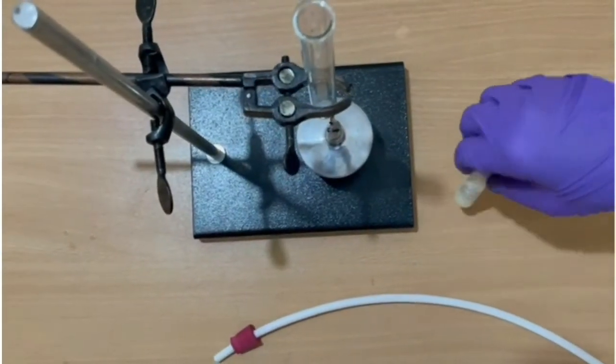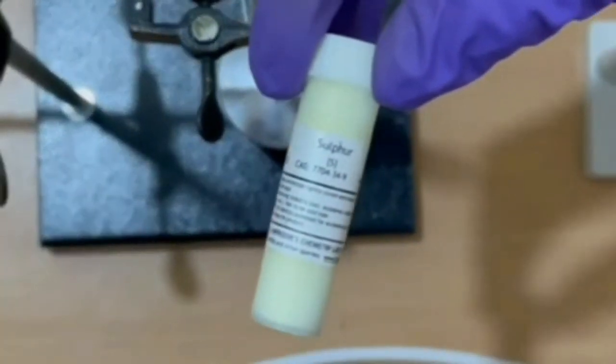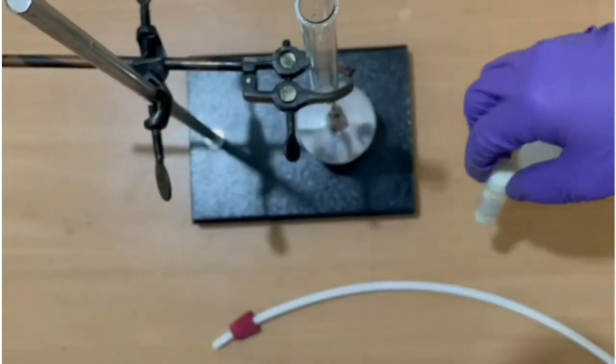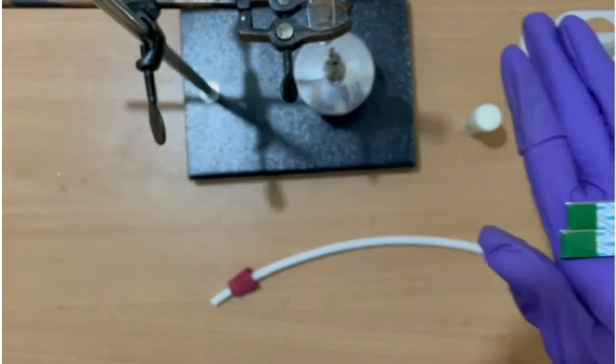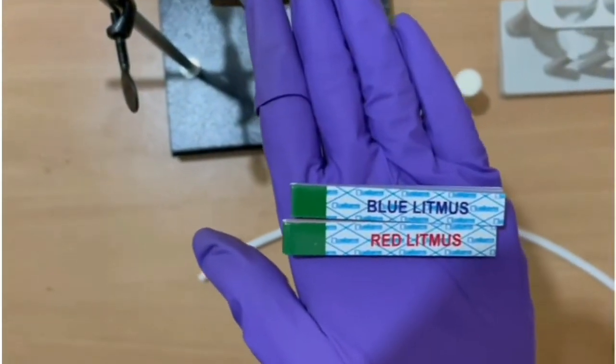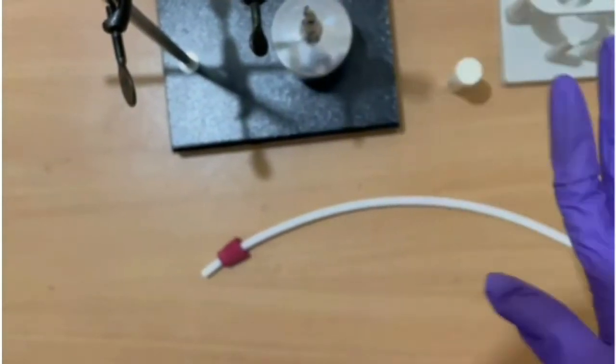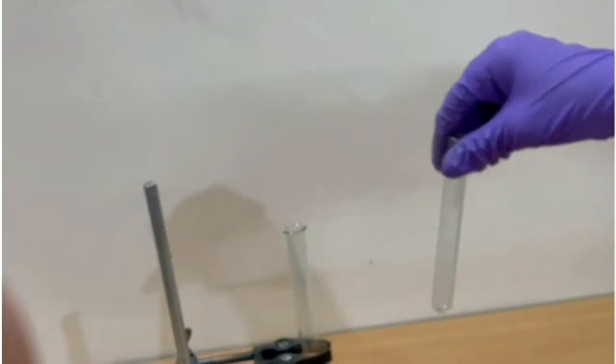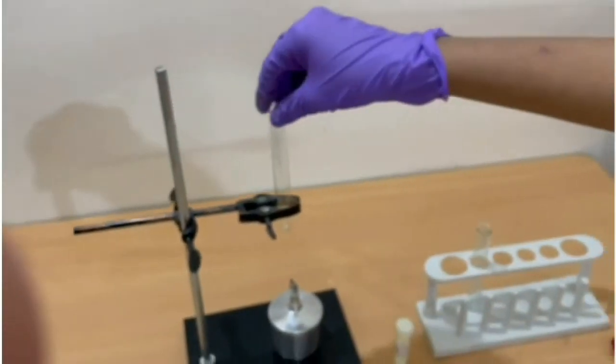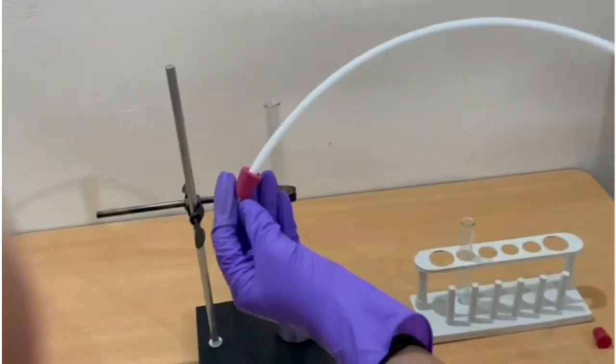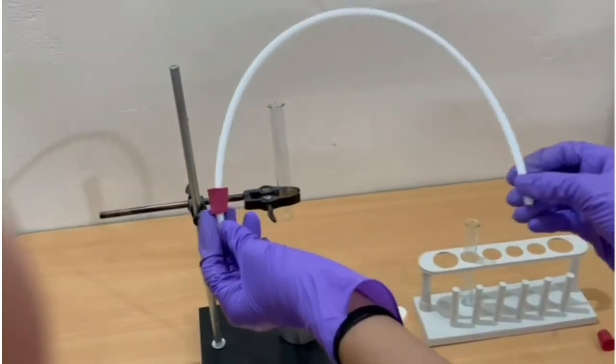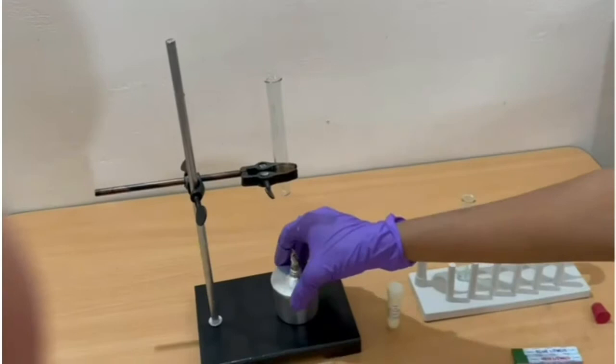For this activity we need sulfur powder, a yellow colored non-metal, red and blue litmus, test tube, cork with rubber tube, and spirit lamp.